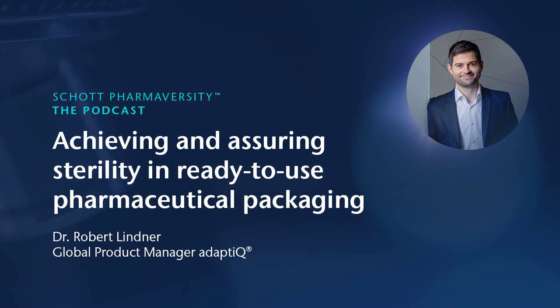Of course, once the sterilization cycle is over, you have a kind of shelf life of the product, and then probability, or statistics, comes into play. You cannot directly measure the sterility, but you can do a lot of steps to ensure that if the product is handled in a certain way, the sterility is assured, for example, over a time of 3 years.